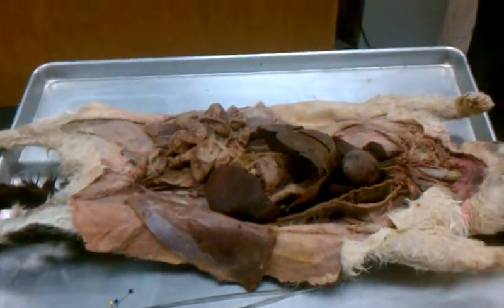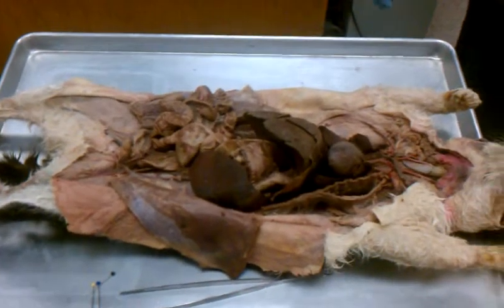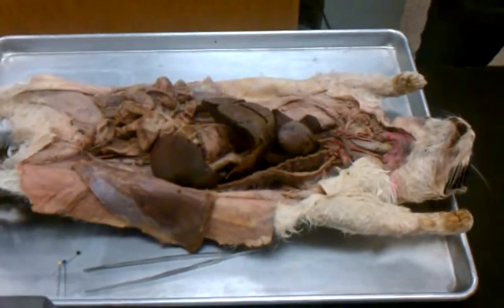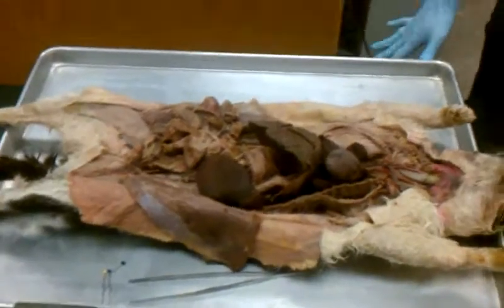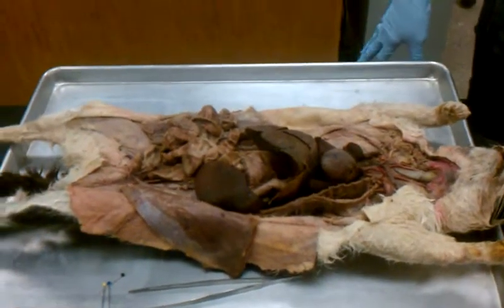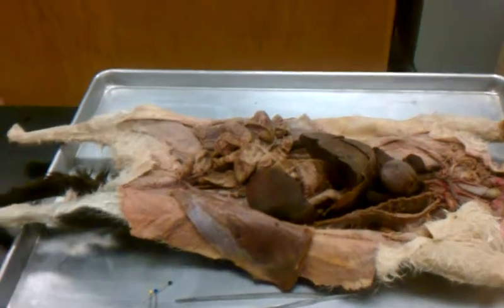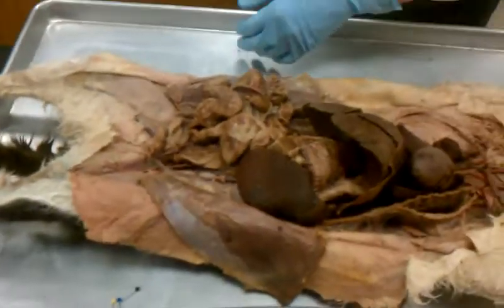Them in a cat dissection and then in a model of the human body. Write the important function of each. I want y'all to be able to identify them. So, digestive glands. I lose my prose again.